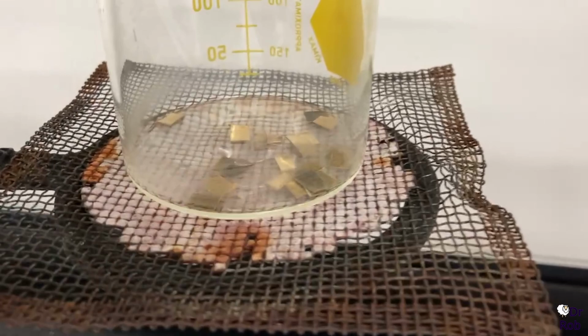You're going to want to conduct this experiment in a fume hood because the gas produced, the NO2, the nitrogen dioxide, is a very hazardous gas, even in small quantities. It can cause severe lung damage pretty easily.